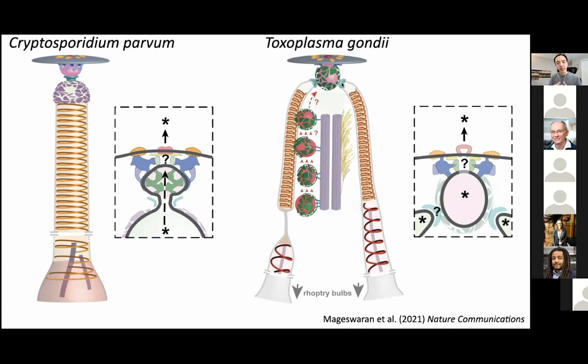People have reported, among many other papers, that when using EM to look at Apicomplexan parasites known to have more than 2 rhoptries in one cell, they observe these microtubules or this chain of vesicles, or both. But for those Apicomplexan members containing only 2 or 1 rhoptries in the cell, for example Cryptosporidium or Plasmodium, this type of system is not observed in the cell. Again, we suppose this might be related to reloading of the AV.